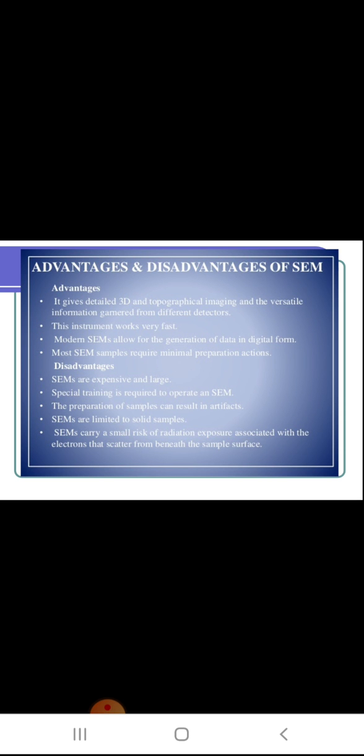Disadvantages of SEM: they are expensive and large. Special training is required to operate an SEM. The preparation of samples can result in artifacts. SEMs are limited to solid samples. SEMs carry a small risk of radiation exposure associated with the electrons that scatter from beneath the sample surface.